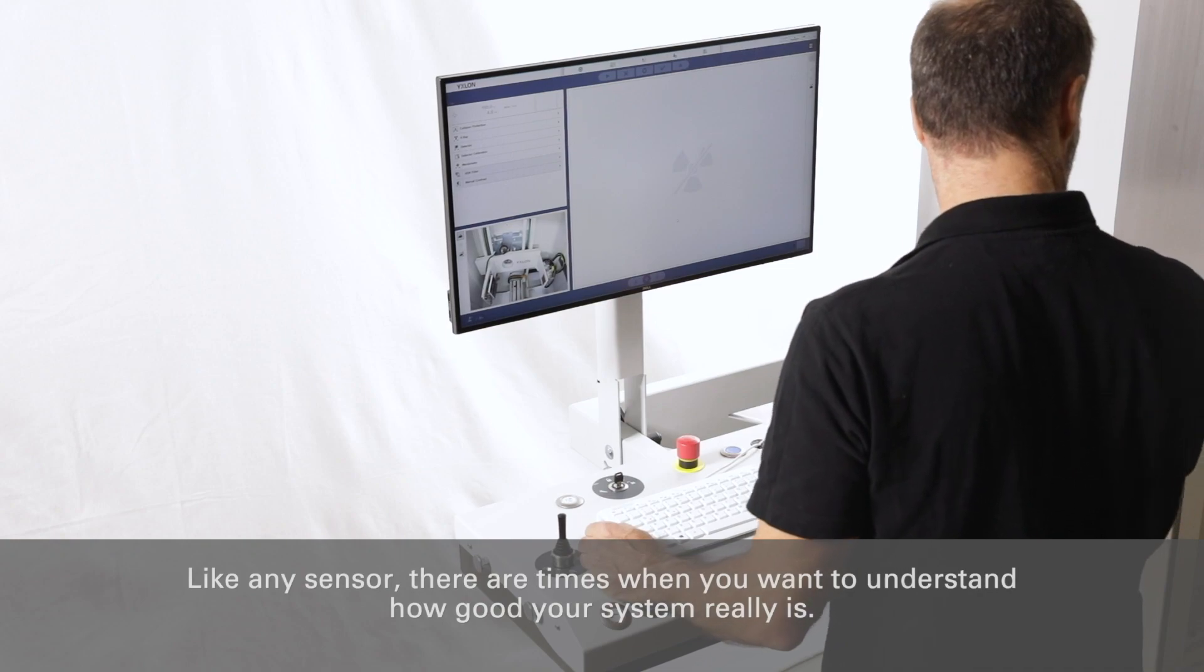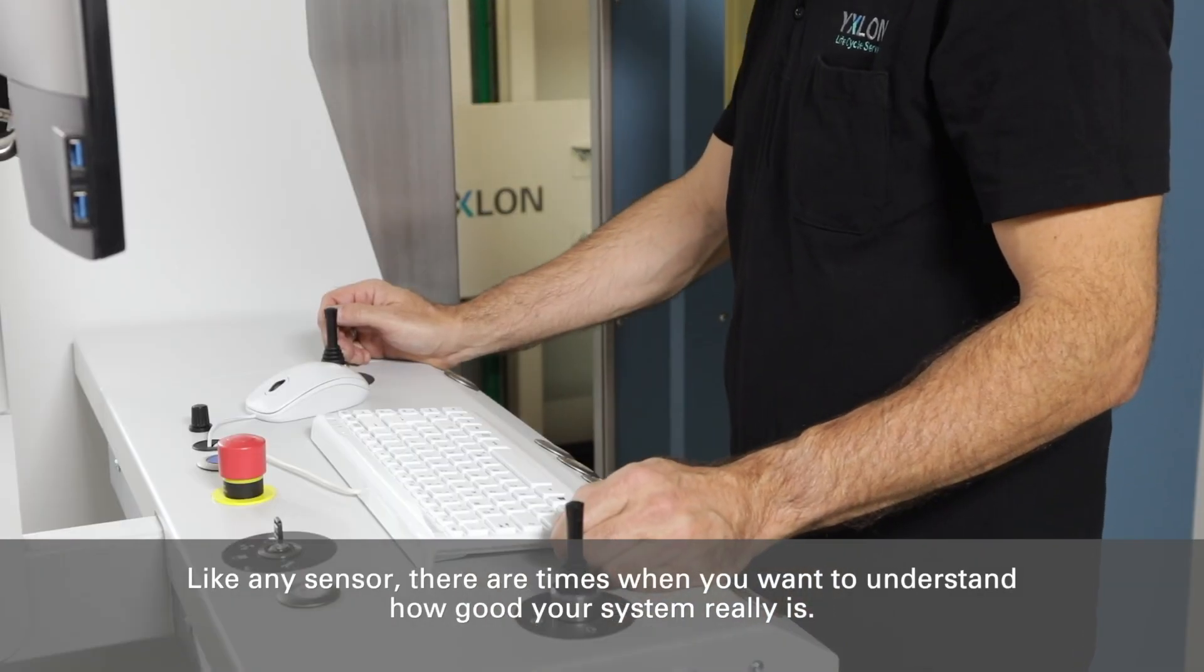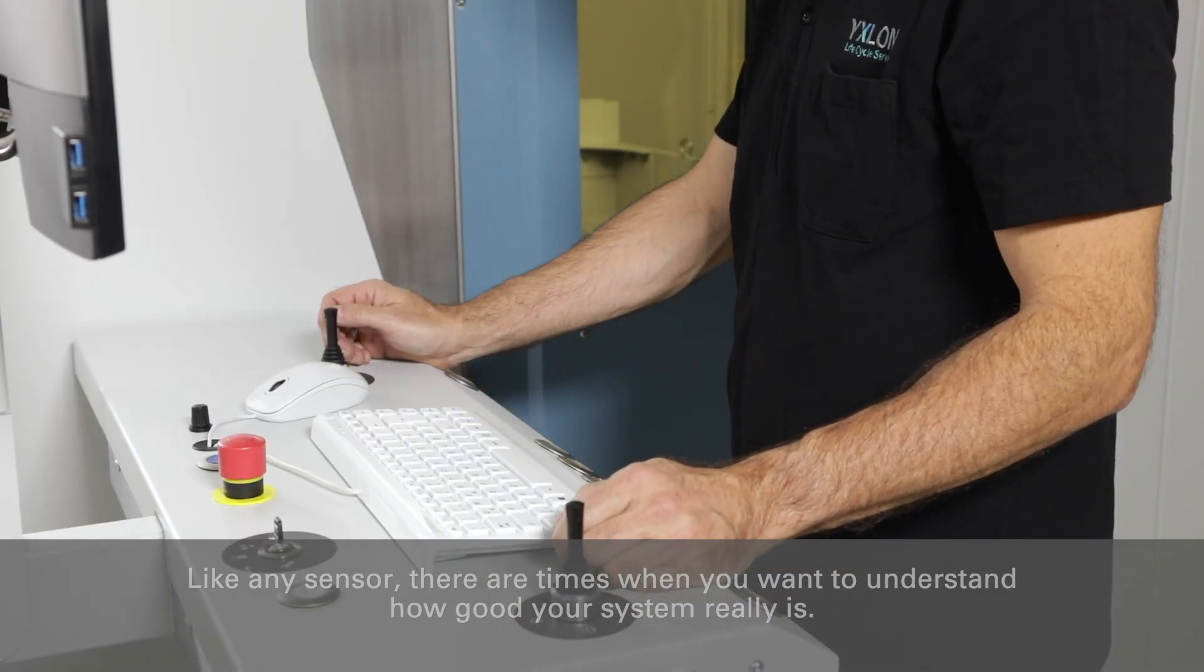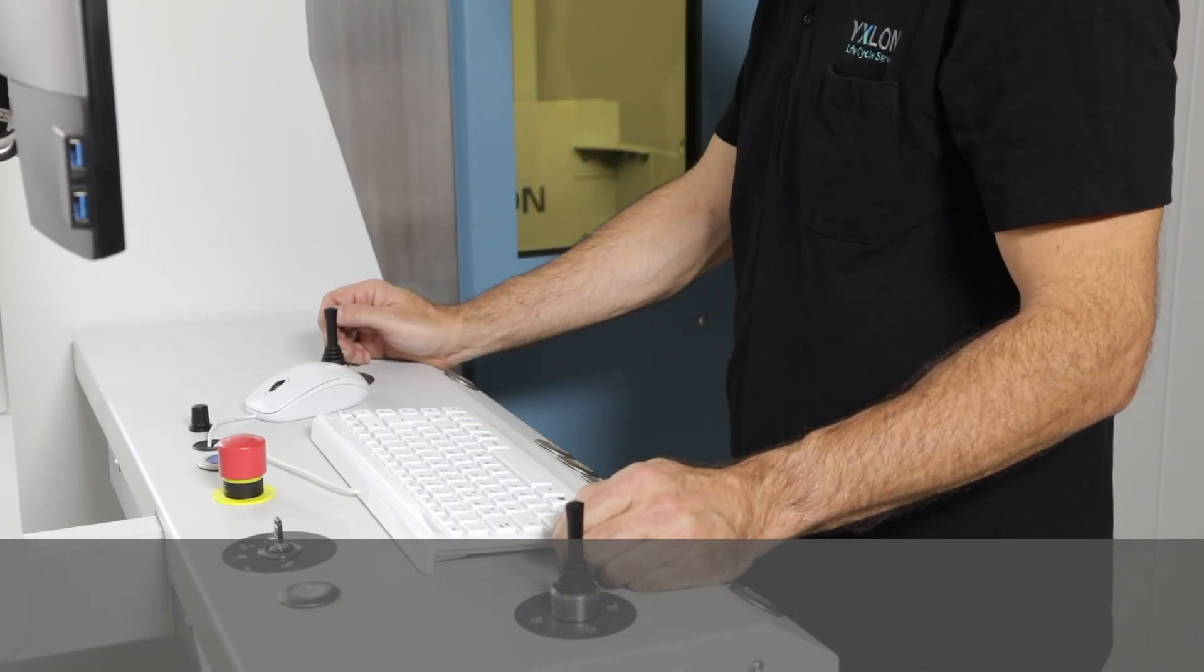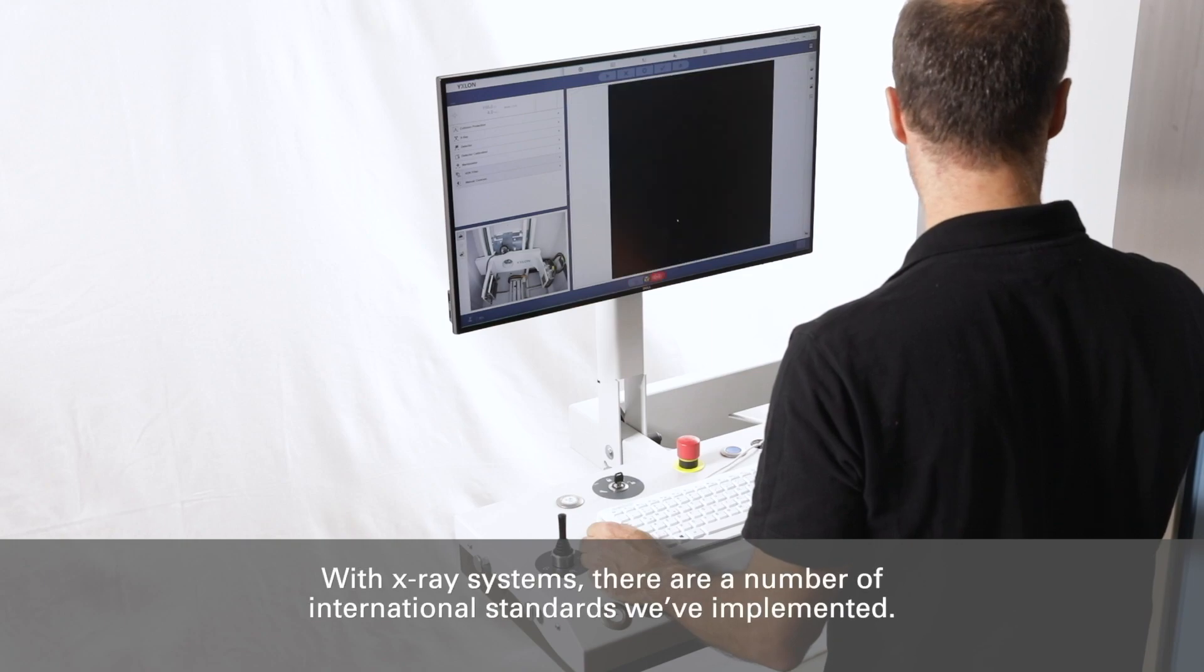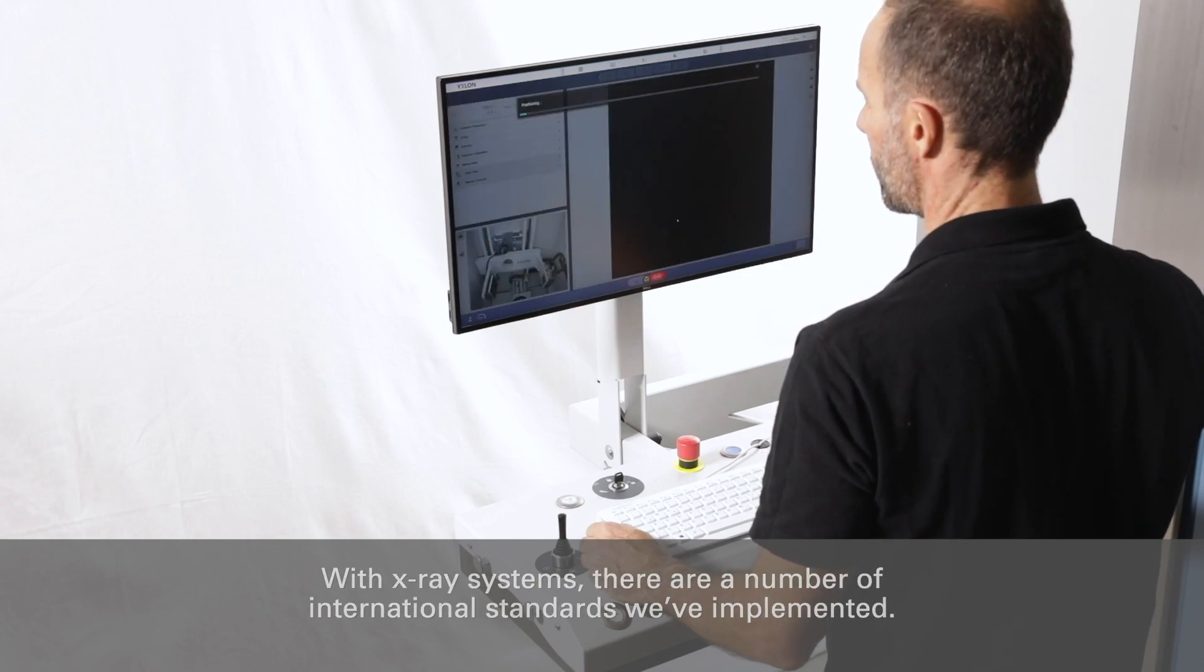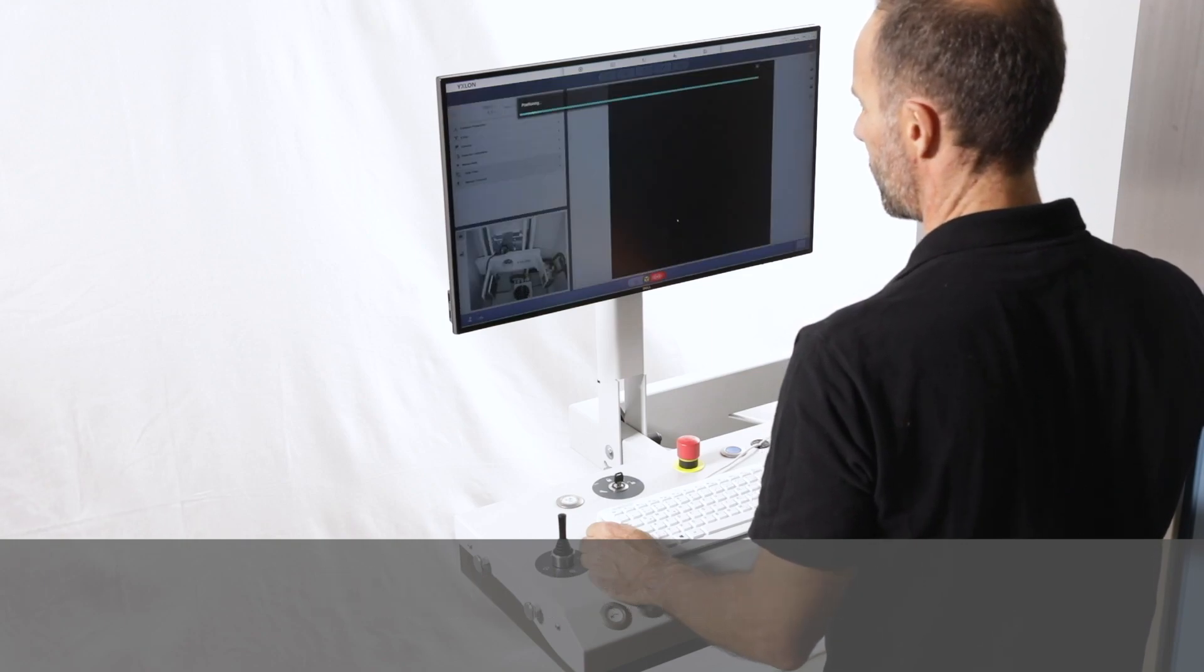Like any sensor, there are times when you want to understand how good your system really is. With x-ray systems, there are a number of international standards we have implemented.